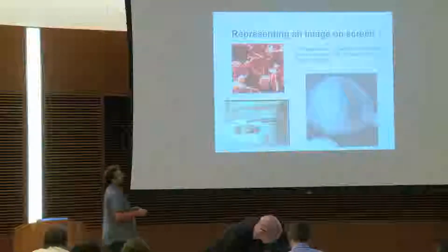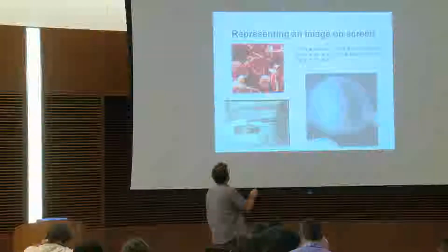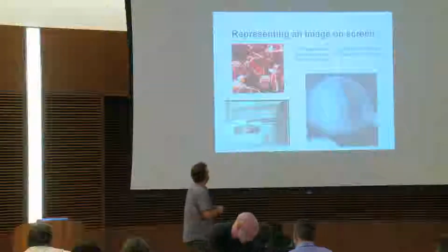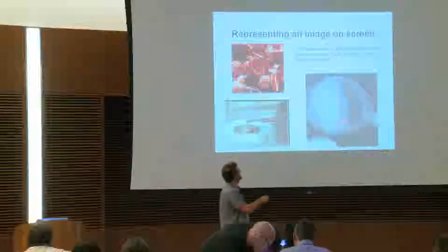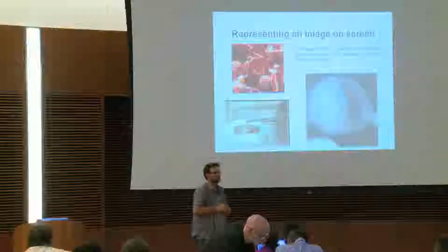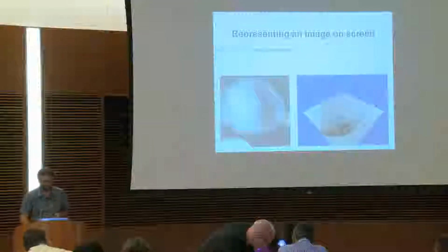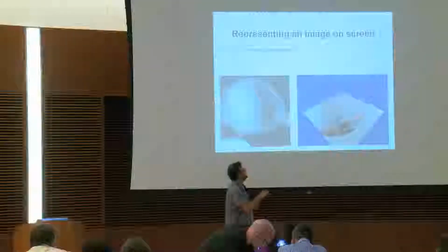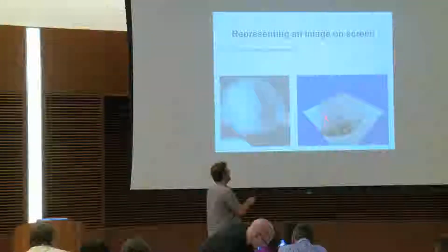Here, for instance, we are using an atomic force microscopy device, shown schematically here, to scan the blood cells that are represented here. What we want to know is whether we have those things called knobs on the blood cells. When you look at the image in 2D, you only see this because it is a 16-bit image, so the dynamic is too big to see the little knobs. If you show it in 3D, with your 2D image here in 3D with a good shading, you start to see them.